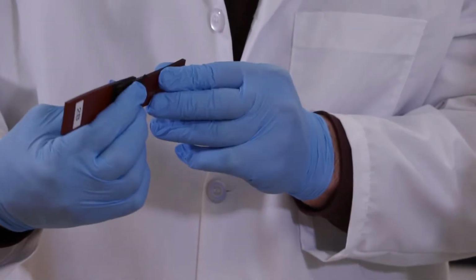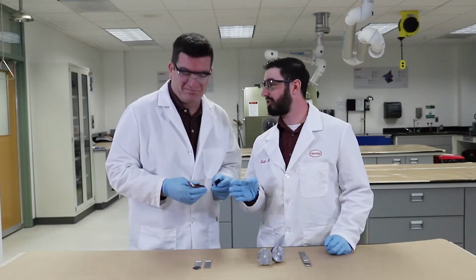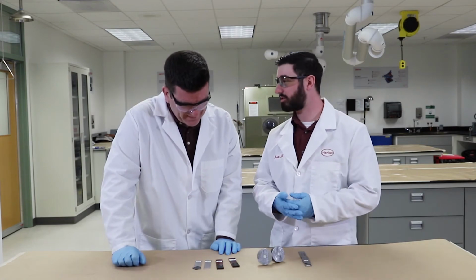Correct. Right? The substrates didn't get damaged at all. They worked fine, but we exceeded the capacity of the bonding material. Correct. This is pretty good, the best scenario of the adhesive itself. Yeah. So in order to correct this issue, you may need to go to a more rigid material to help structure that joint better.